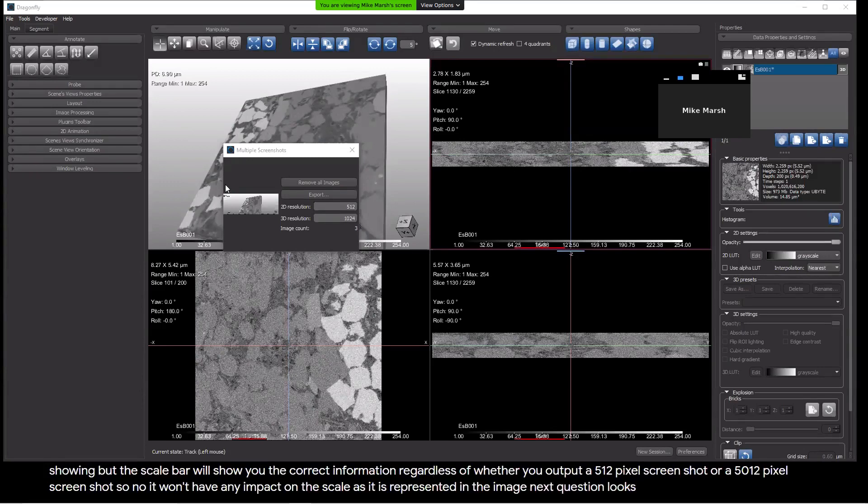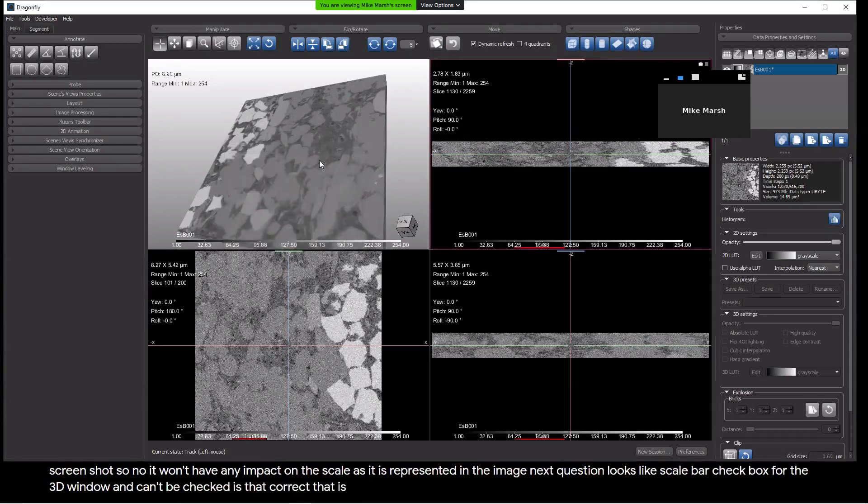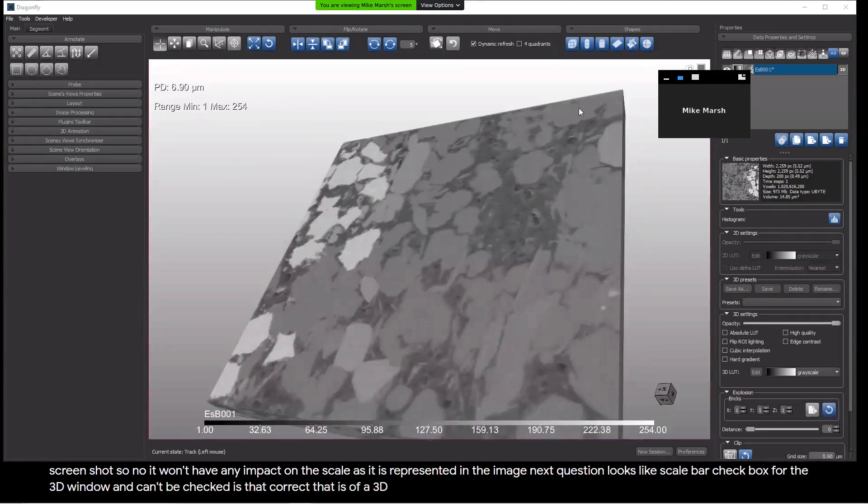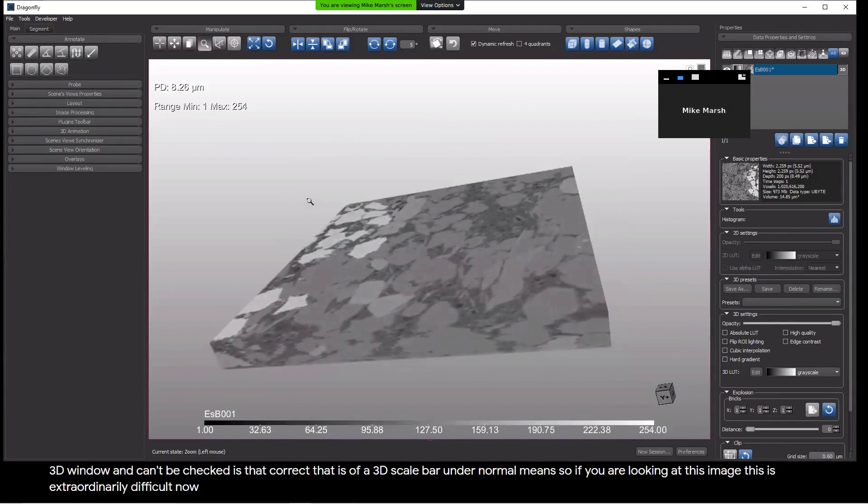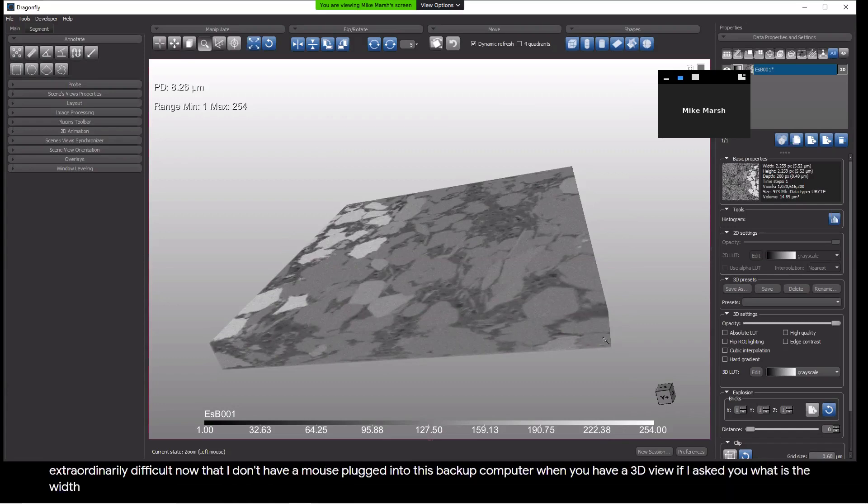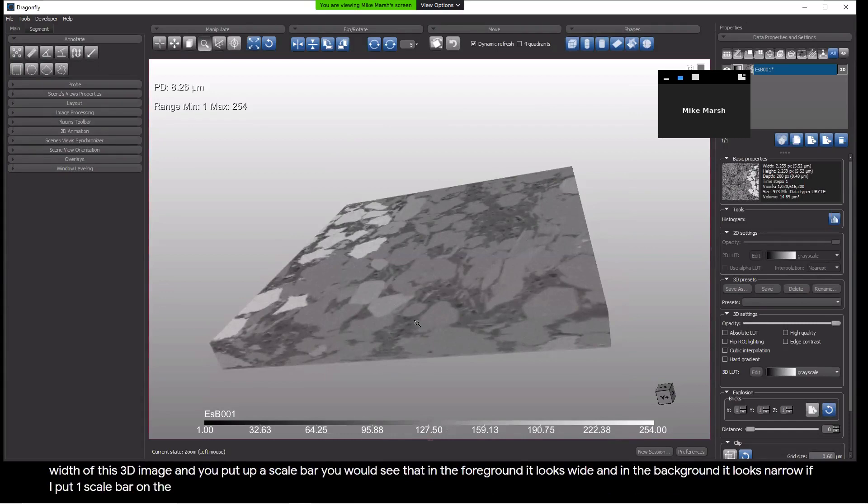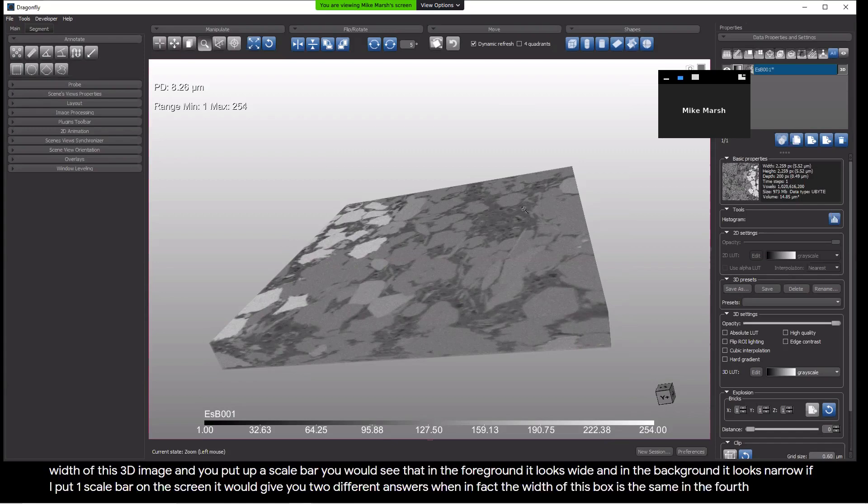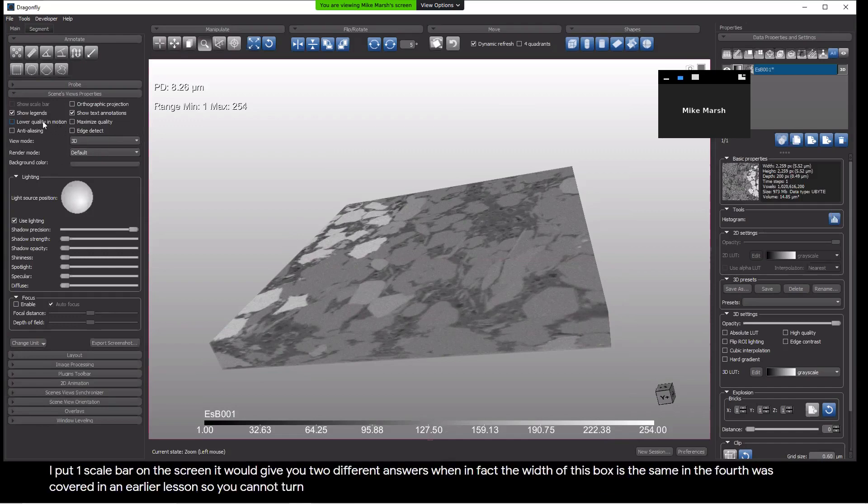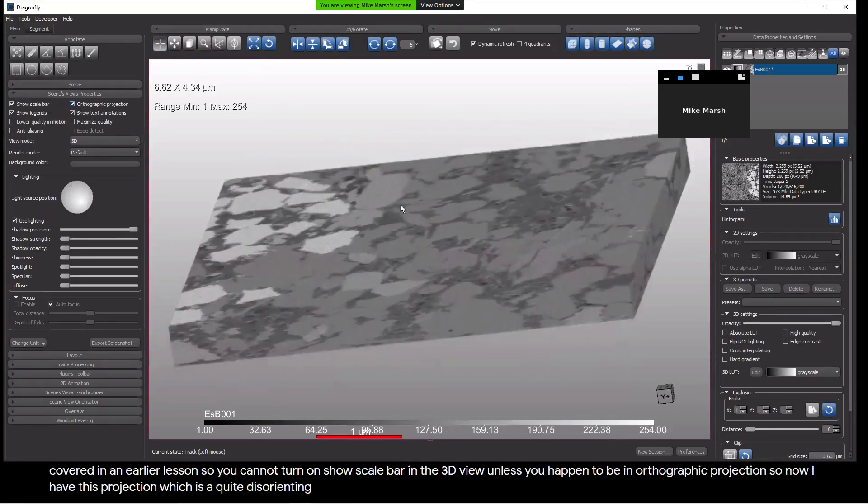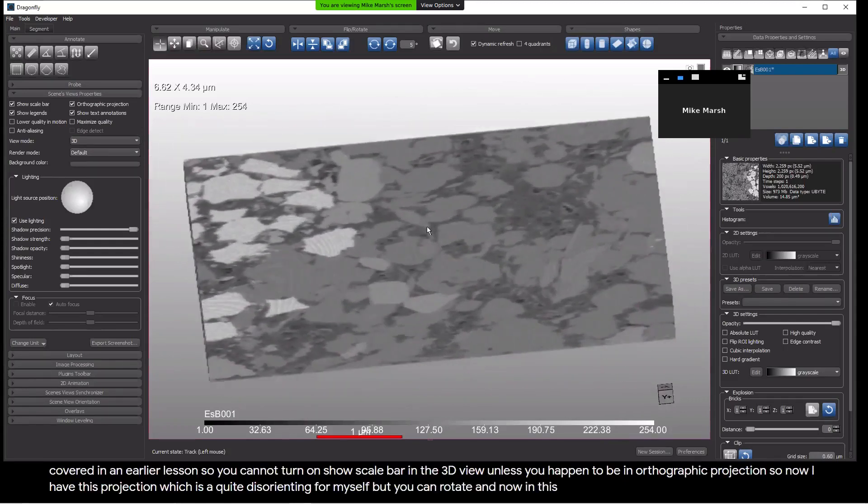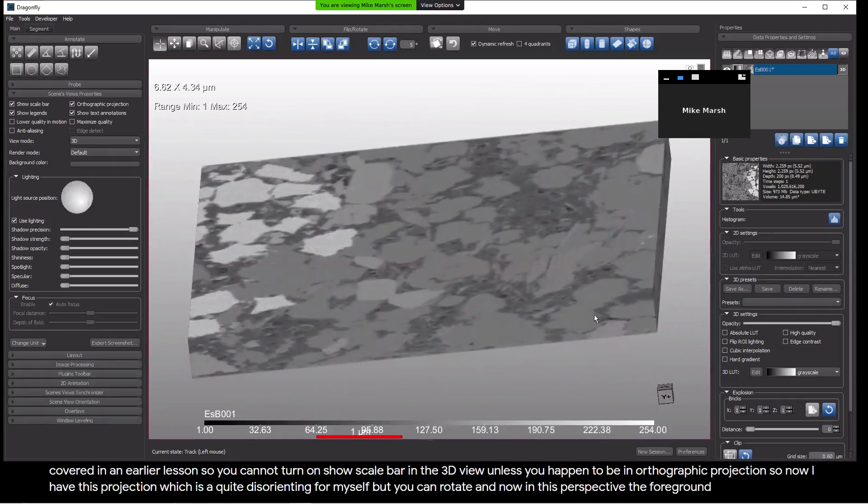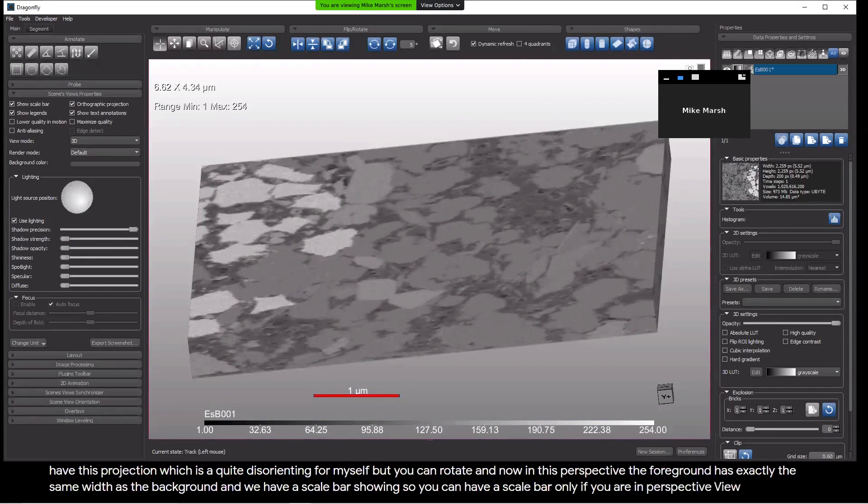Next question. Looks like scale bar checkbox for the 3D windowing can't be checked. Is that correct? That is absolutely correct. You cannot have a 3D scale bar under normal means. When you have a 3D view, if I asked you what is the width of this 3D image and you put up a scale bar, you would see that in the foreground it looks wide and in the background it looks narrow. If I put one scale bar on the screen, it would give you two different answers when in fact the width of this box is the same in the foreground as it is in the background. So you cannot turn on show scale bar in the 3D view unless you happen to be in orthographic projection.